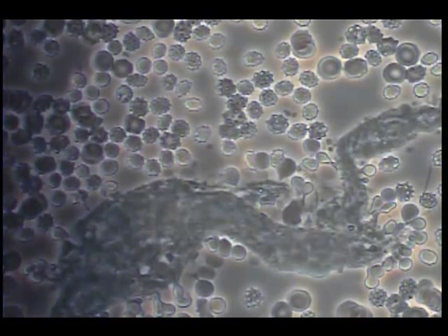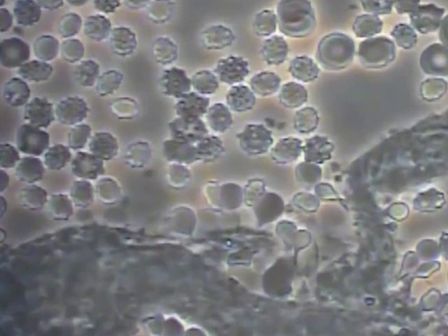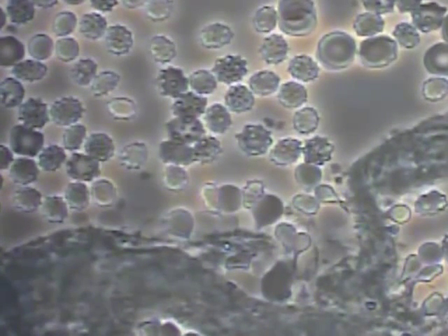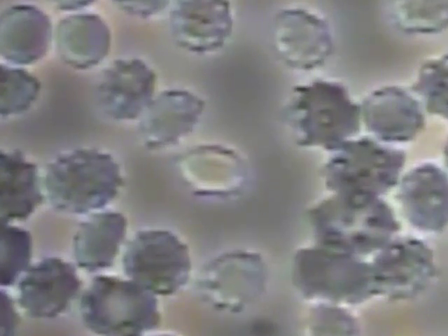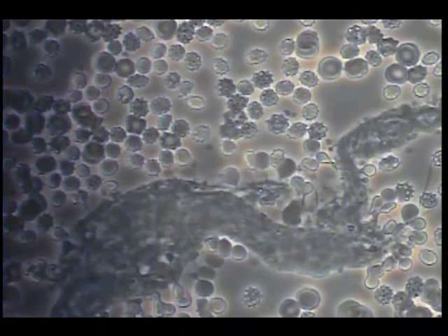Now we have added an extra few minutes of PEMF. We can see that the cells are starting to reinflate. They still have bumps on them, but they are not as collapsed and hard as the one in the upper center of this slide still is.